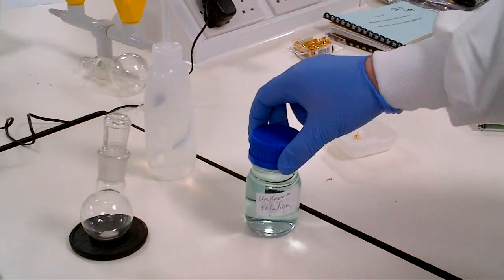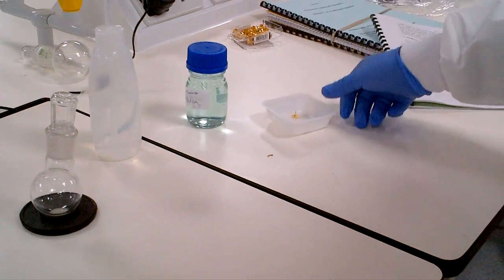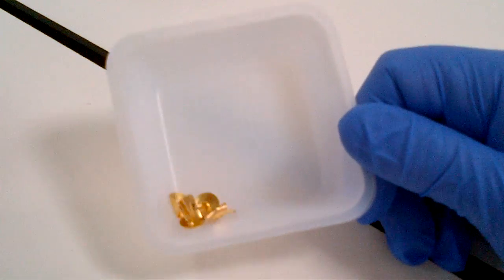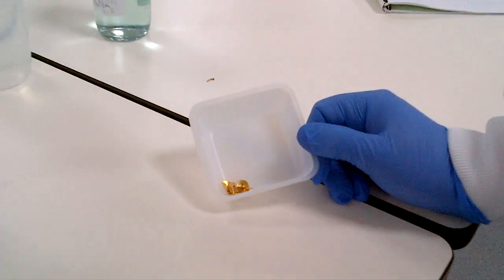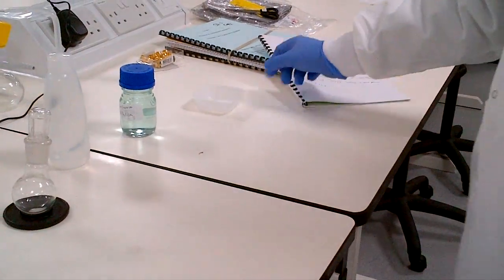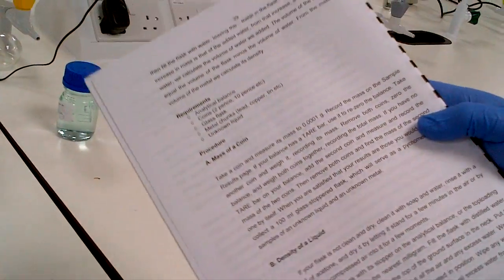So you use the density of water to find the volume of the flask. You're then going to find the density of an unknown solution, and you've been left a tray of pins, some brass pins, so you're going to find the density of this metal alloy. The first part asks you to look at the mass of coins.